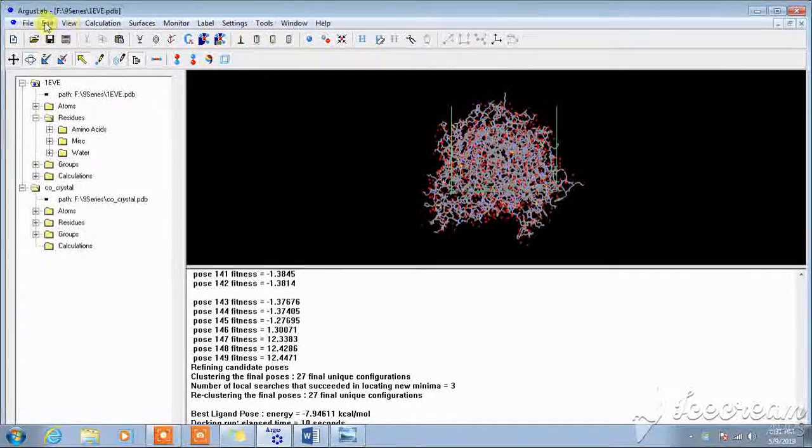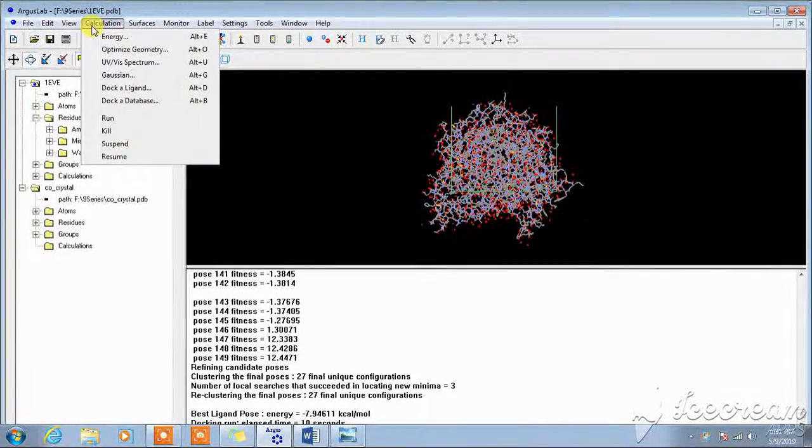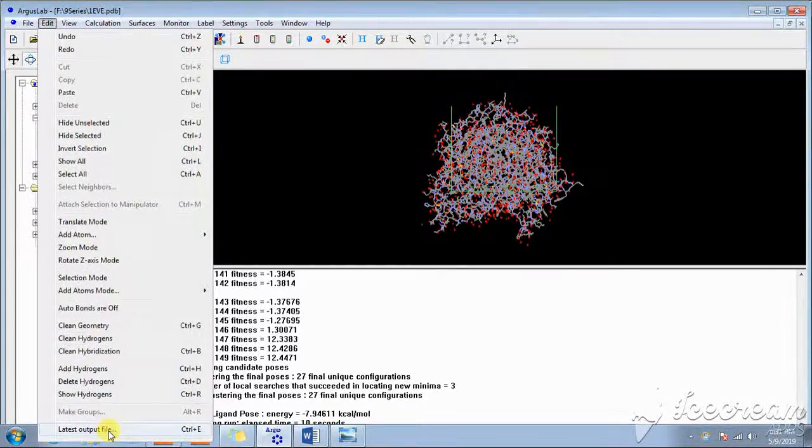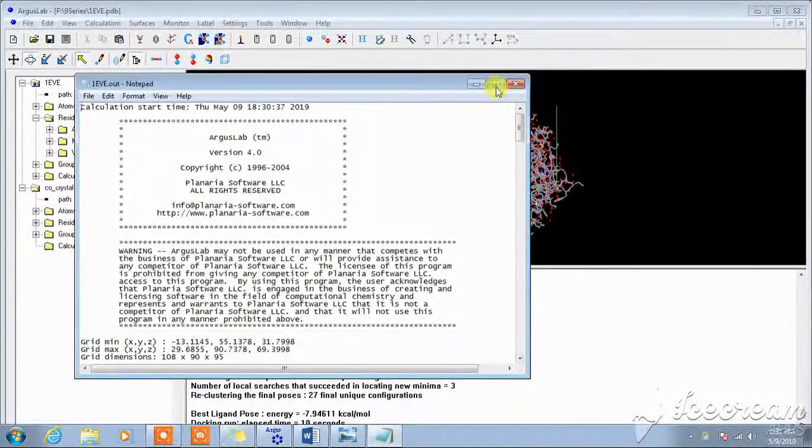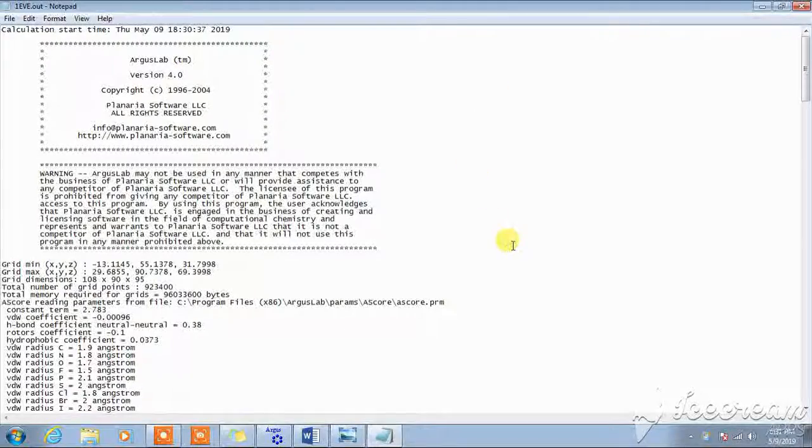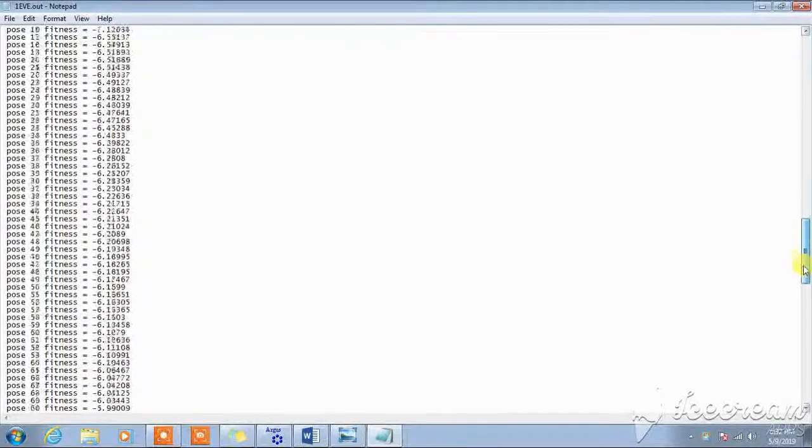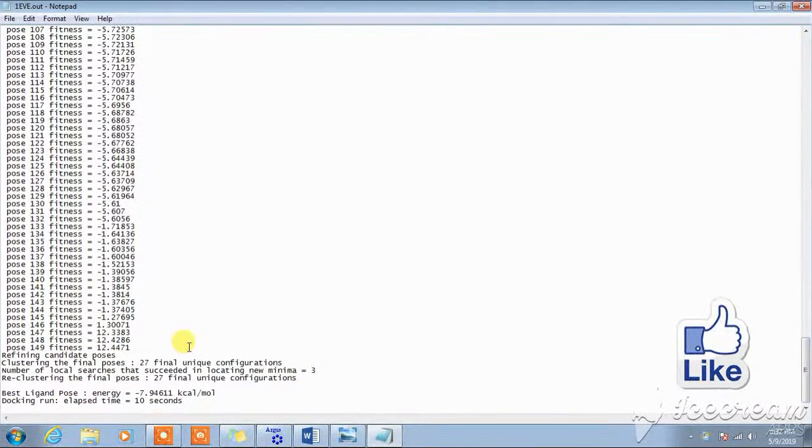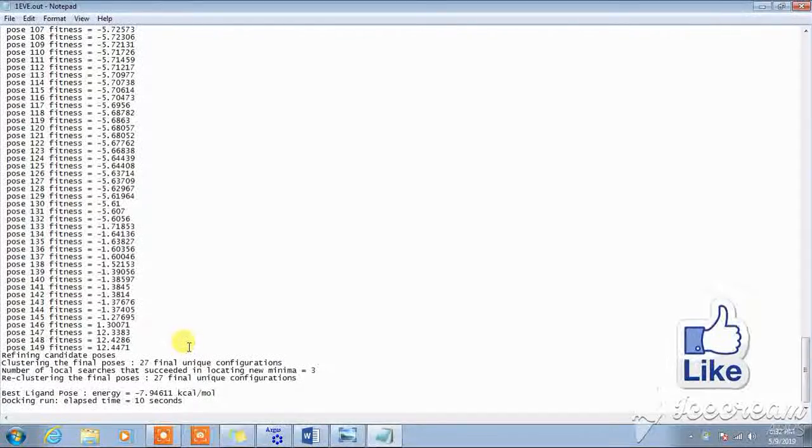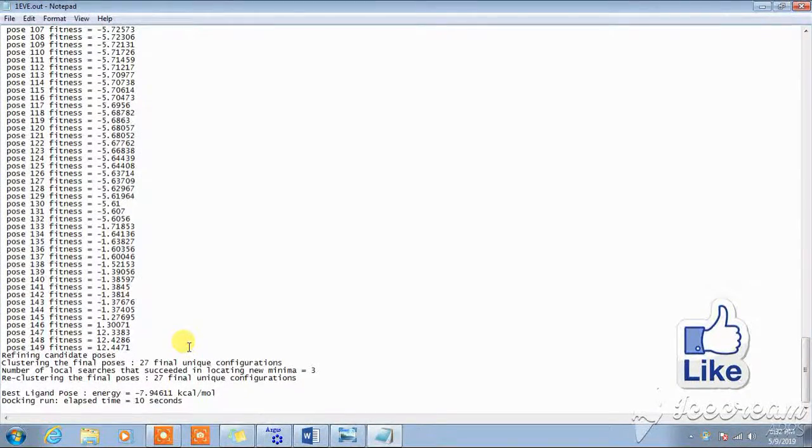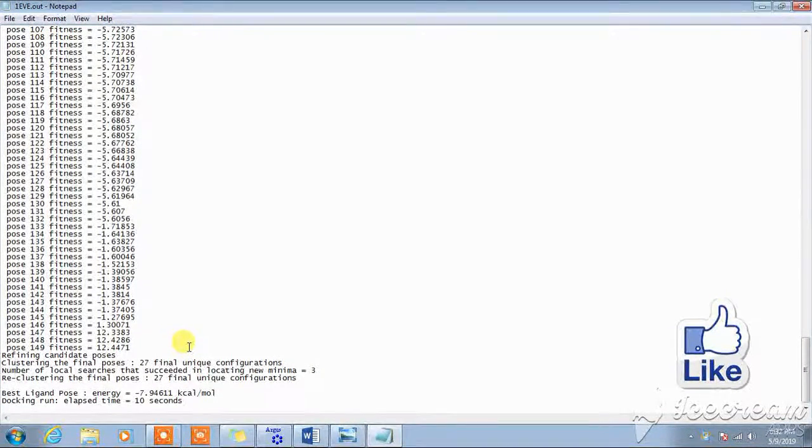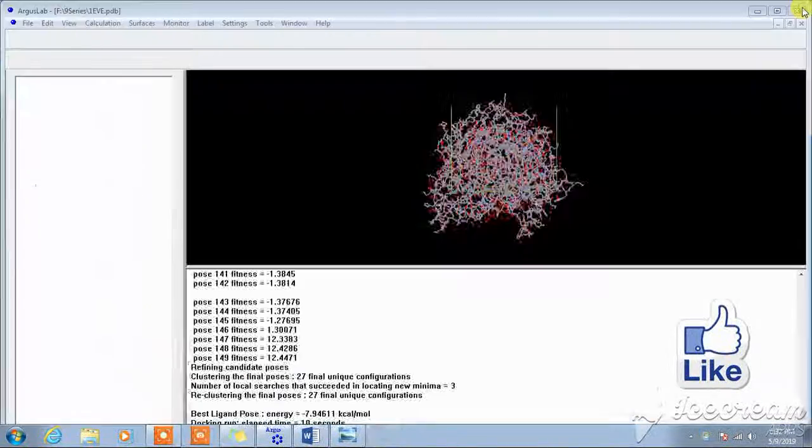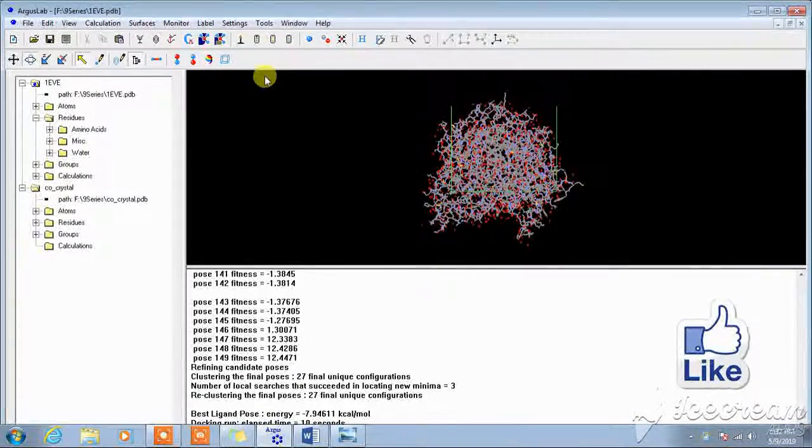You can save this file as a calculation. Go to the latest output file, save this file. See, this is the output file of that particular ligand. These are the one, almost 150 times this docking engine performed the docking of the ligand. And this is the best ligand pose energy. This file you should save and use it for writing the result.